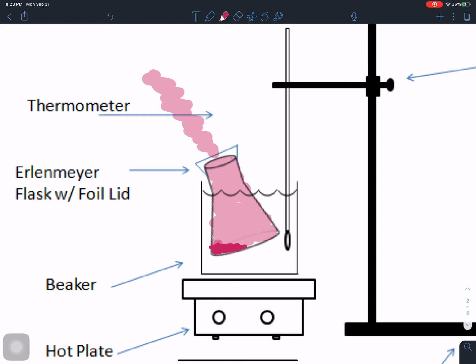Now, of course, the gas that we're using is not nice and brightly colored like that. It looks like air. And so we're going to continue doing this until we can't see any more liquid in the flask. And then we will know that the whole flask has been filled with the gas. And at that point, we'll take the flask out. So all of this will blow away. This is done with good air ventilation.